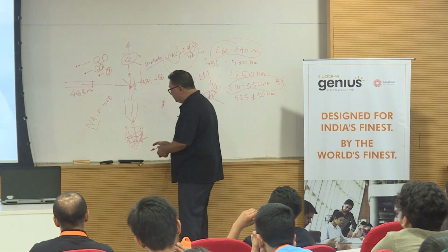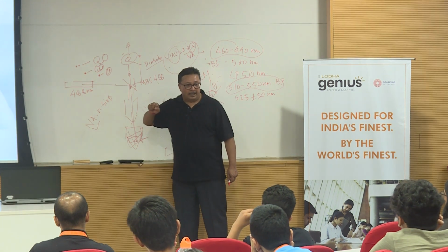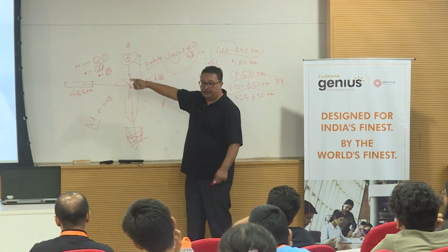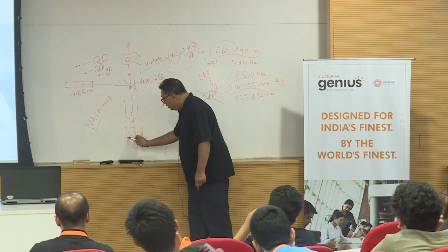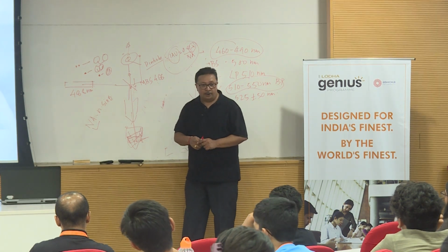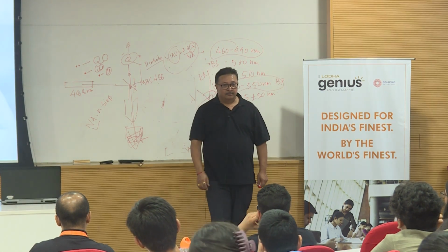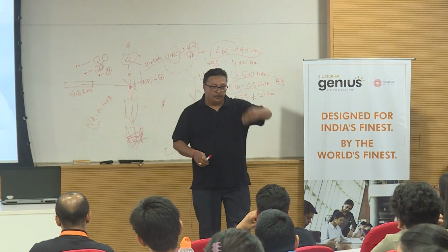Whereas in a regular fluorescence microscope, what happens? You excite the whole volume, you collect emission out of the whole volume, and you don't know which information comes from which focal plane. But in a confocal, when you have a pinhole in the conjugate focal plane with an opening of 1 AU, it allows only a single plane of information, the in-focus information, to pass through. All the rest will be obstructed. It means that you clearly get information from a single plane without any background from the above and below focal planes.